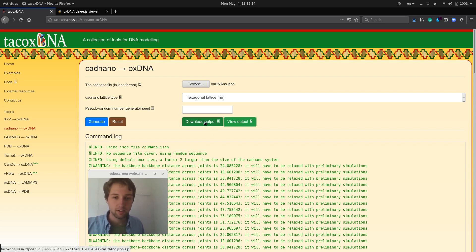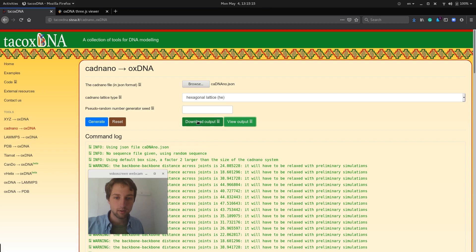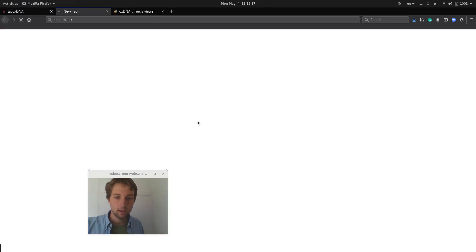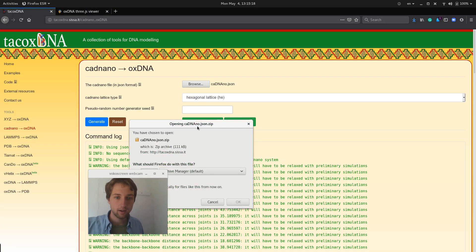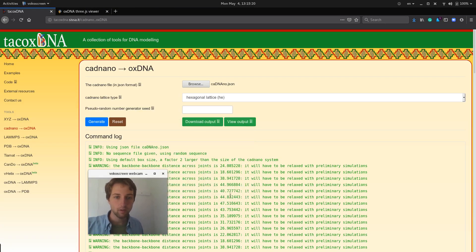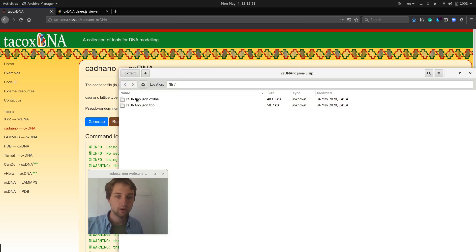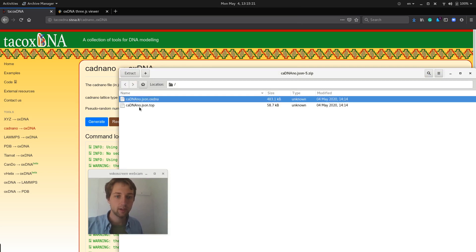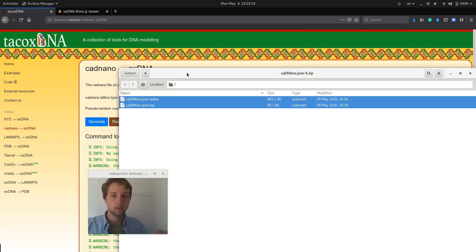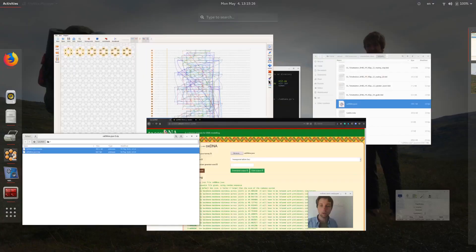But if I download this, it will give me a zip file, and I can just extract these two files somewhere I want to save them.